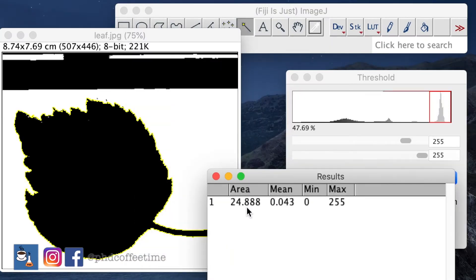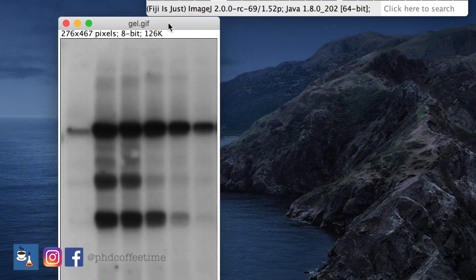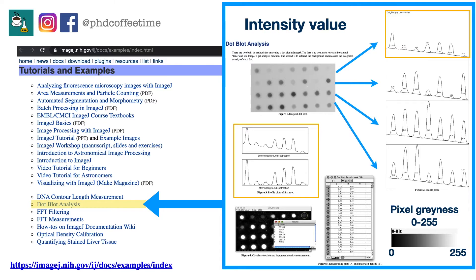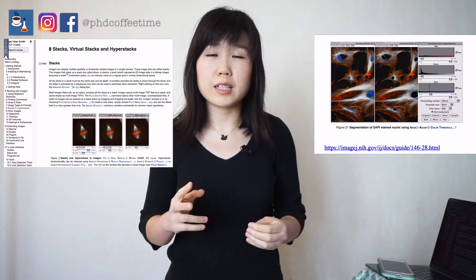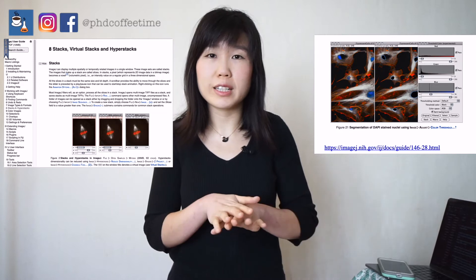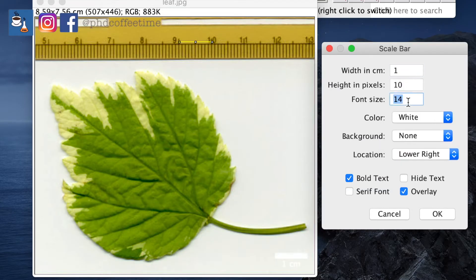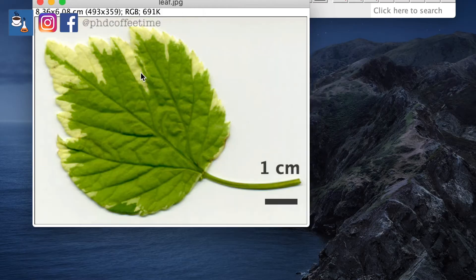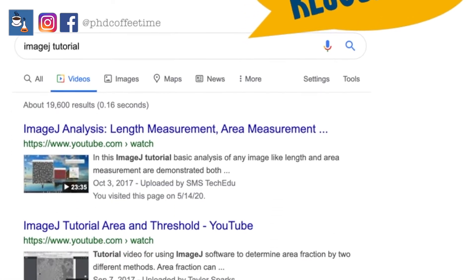I'd like to cover a few applications of ImageJ and inspire you to think about this open-source, free, and powerful software. From an image you can extract size, area, or even volume from a stack of images. You can also measure the intensity of a protein band from a gel. For microscopy, you can separate and overlay fluorescence images of different colors. Even adding a scale bar to a figure is possible in ImageJ. It has a strong global community, so you can always find answers online.